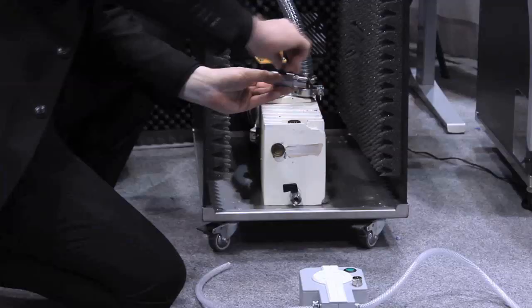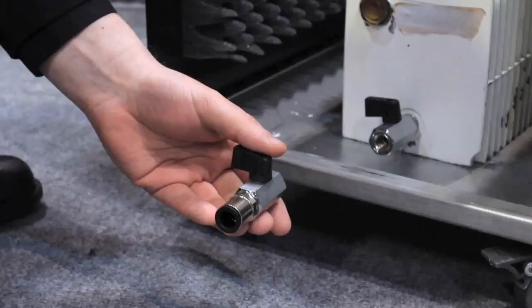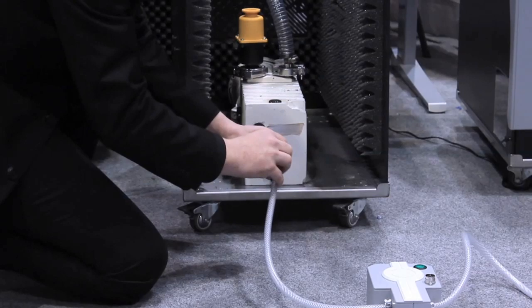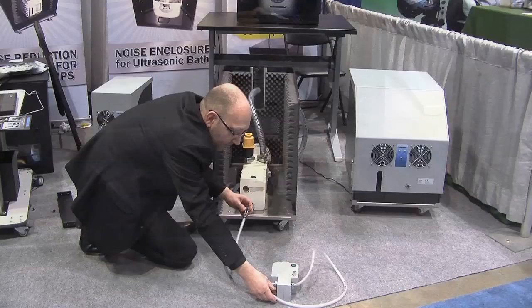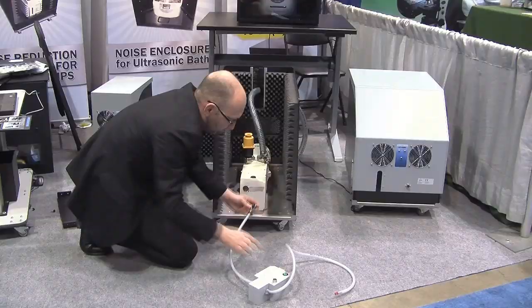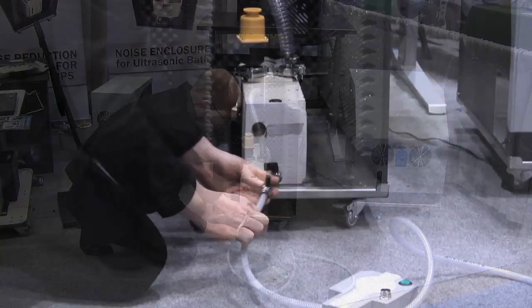This valve is closed when you do not need to change the oil. The day you need to change it, you just connect the pipe here like that, open the valve, put the other side directly into a waste container, and turn on the pump. You will have suction of the oil going directly into the waste container. If you have only one pump it may not seem significant, but if you have ten pumps to service, you will save a lot of time.